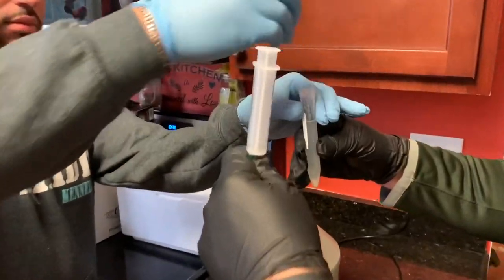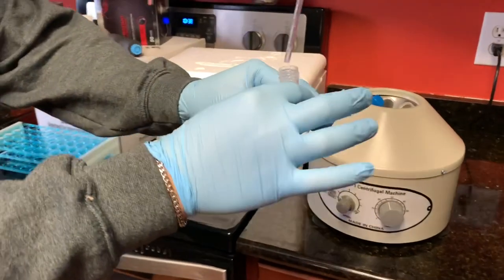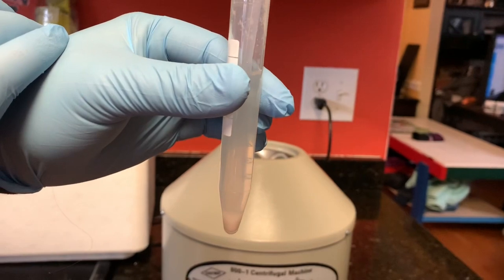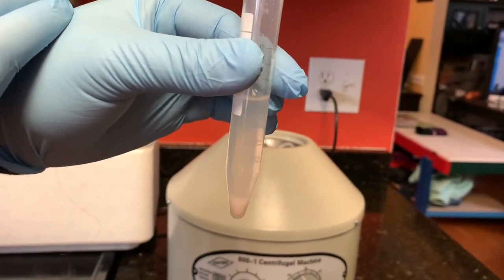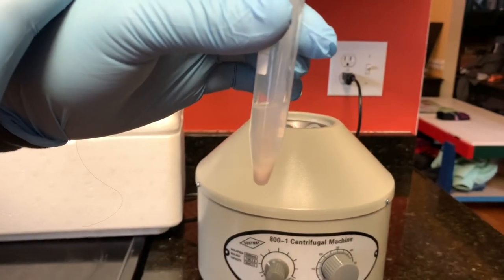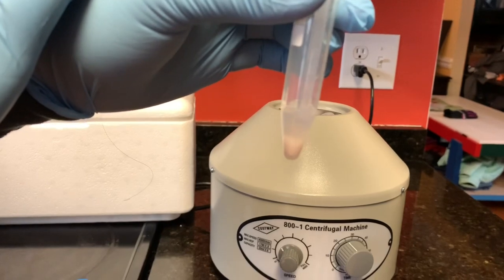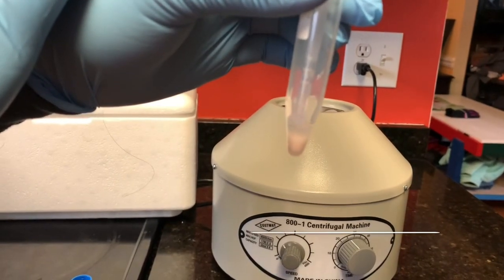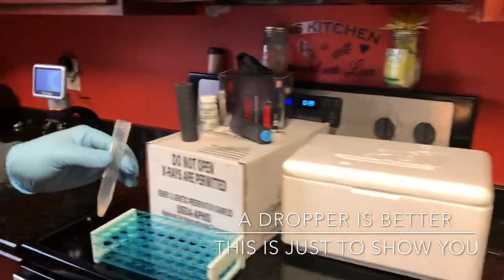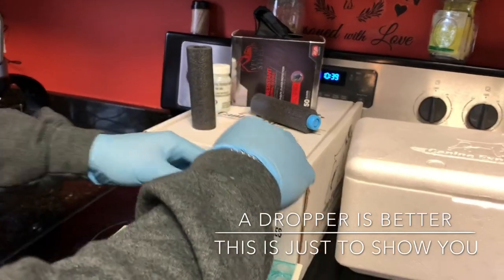Cool. All right, guys, so 10 minutes have passed. What we're gonna do is remove the clear so he can move his other hand out the way. As you can see, at the bottom is the good stuff that we wanna keep, and we're removing all the impurities. Semen. That's good, Justin. We'll leave it there. Put the top back on it and just put it in there.